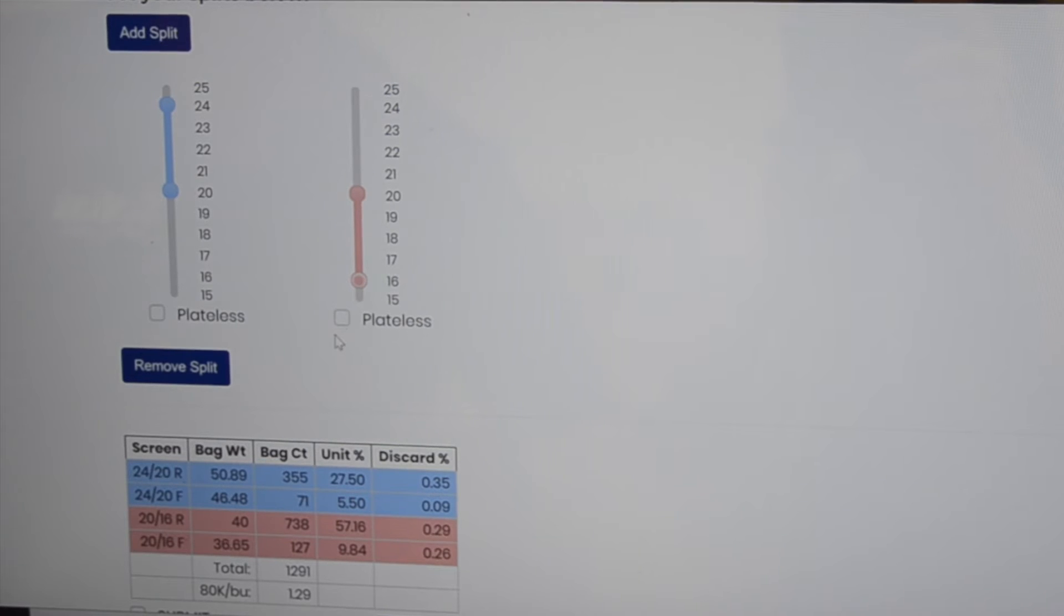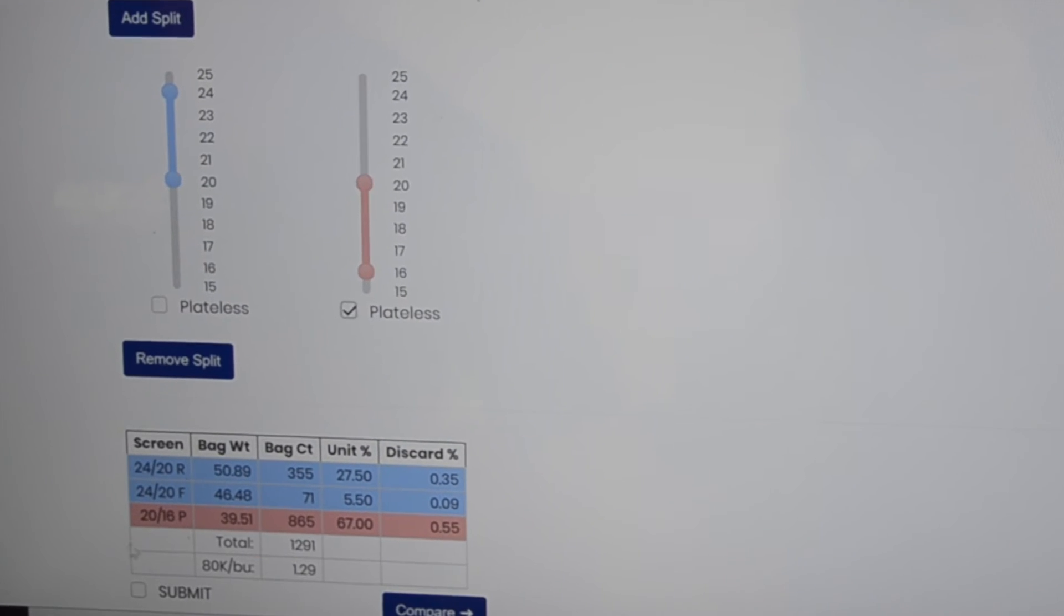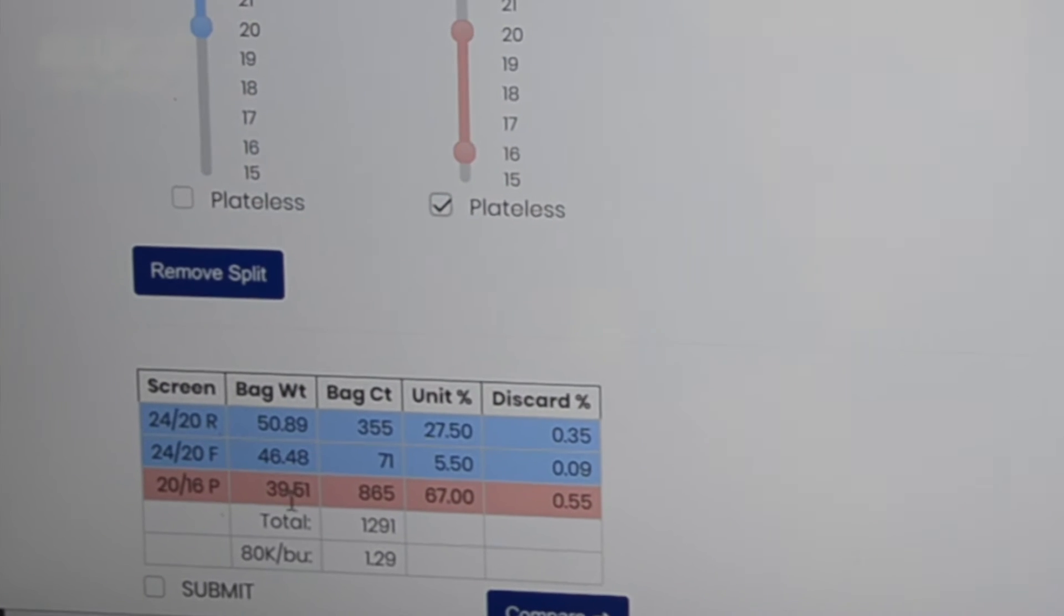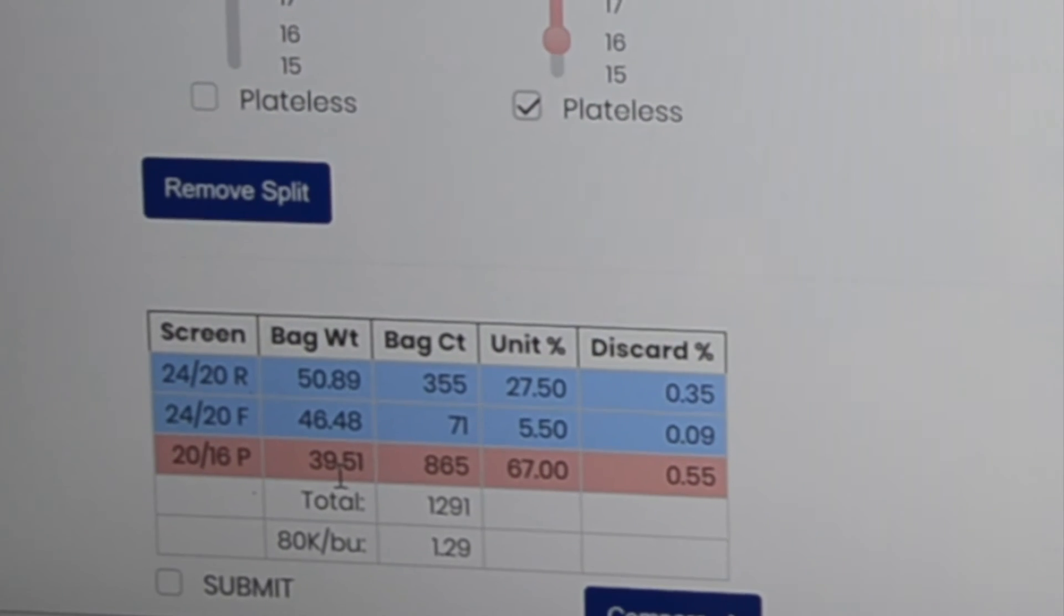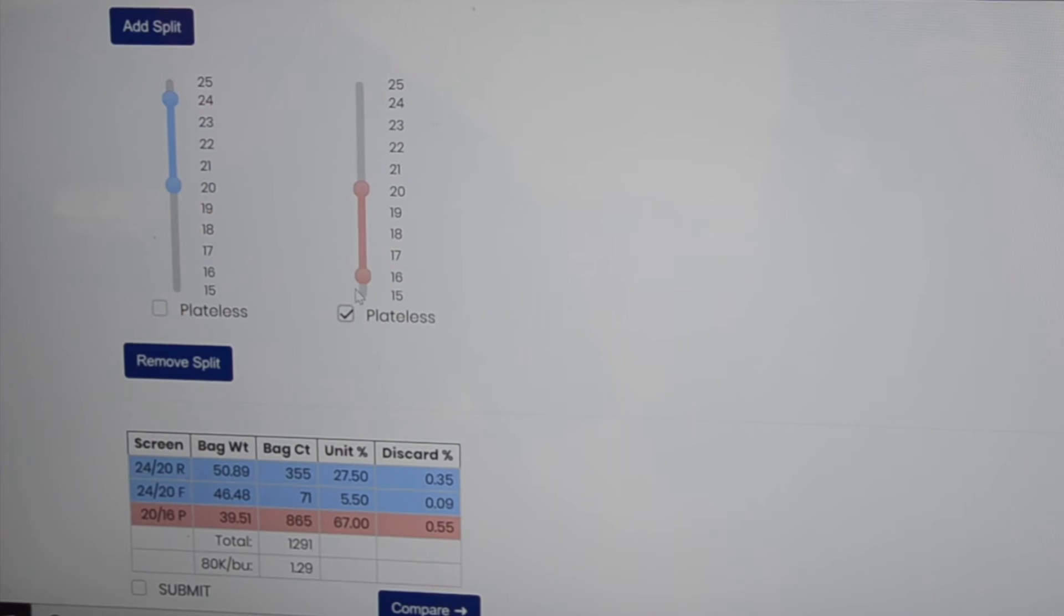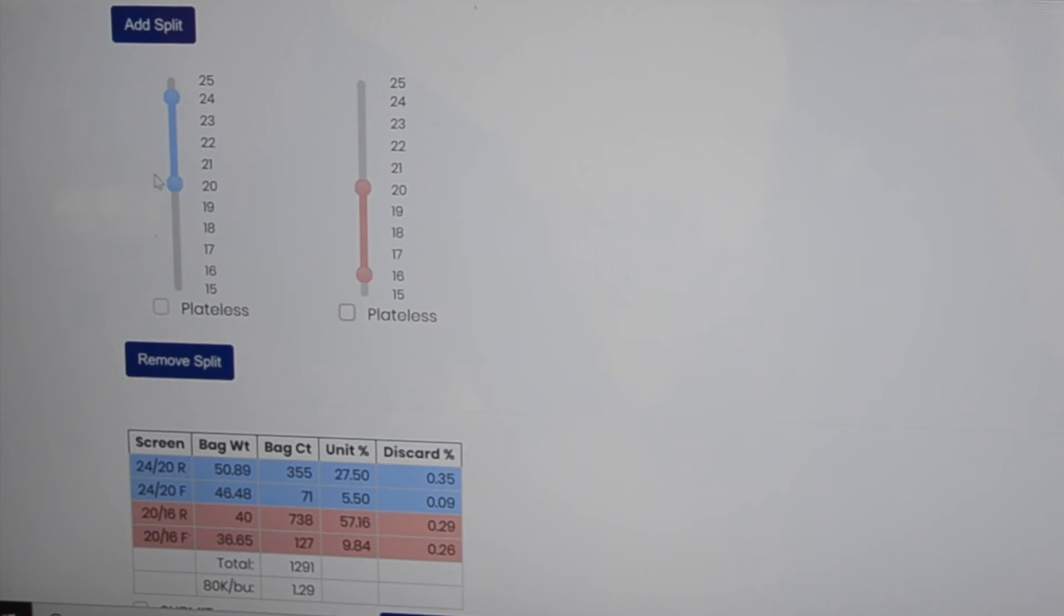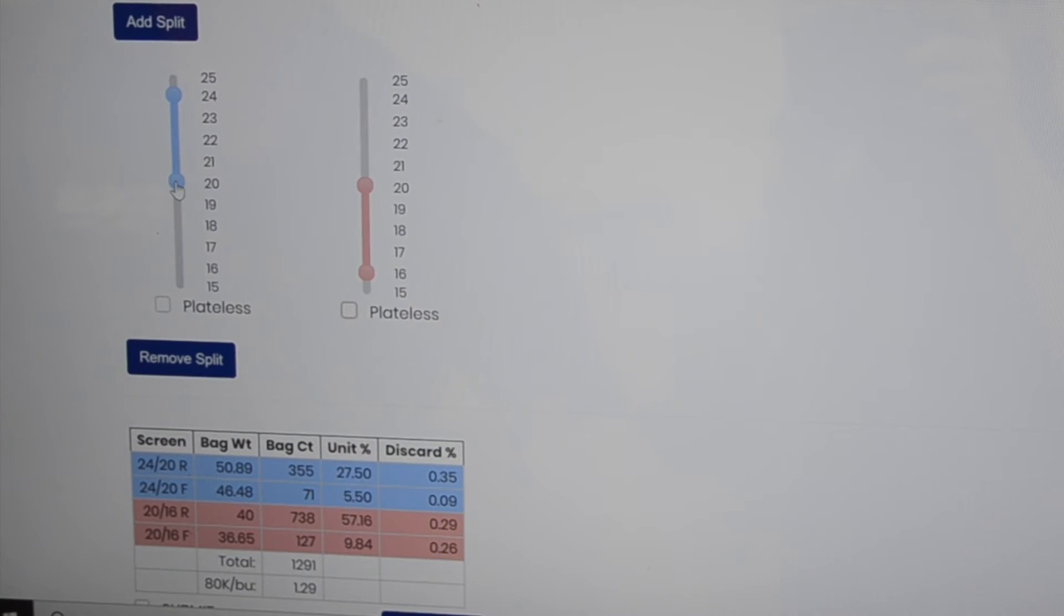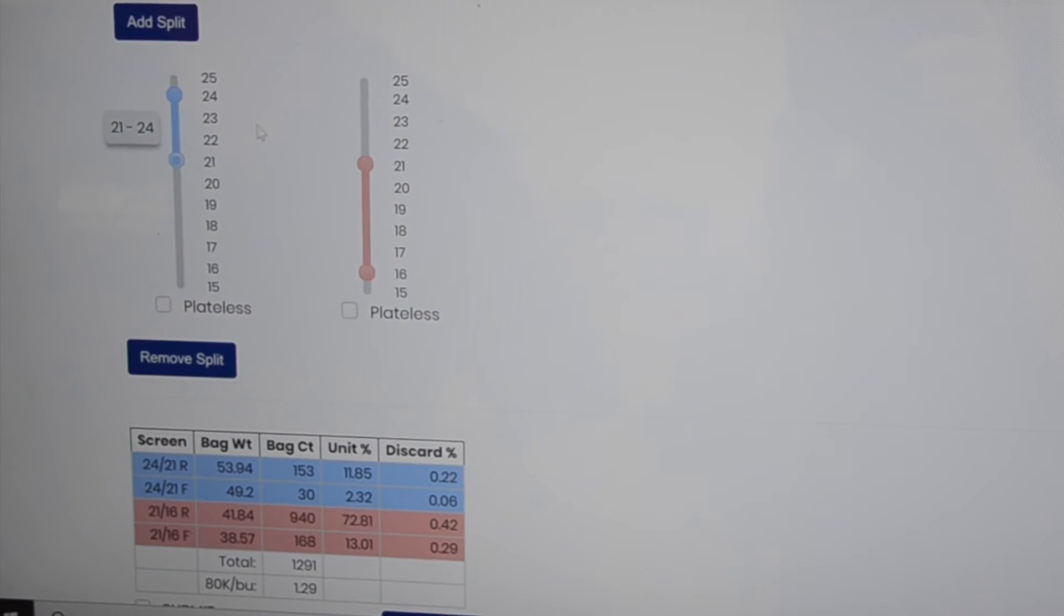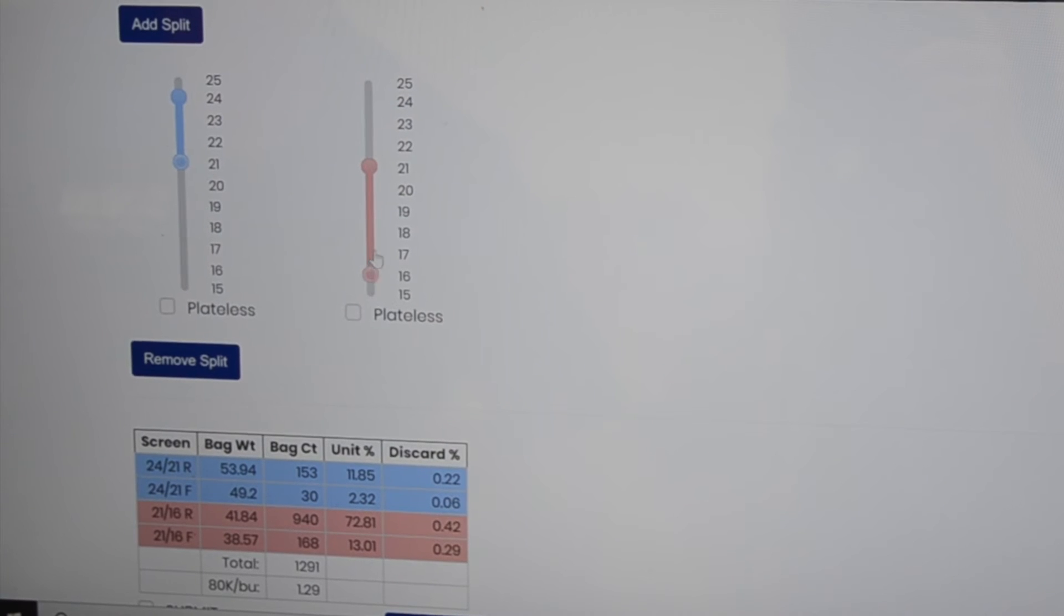Maybe you want this smaller end to be plateless. Just click the plateless button. It combines the flats and rounds with the bag weight and bag count. Maybe you want to have it be a 24 21 with a 21 18 in there.